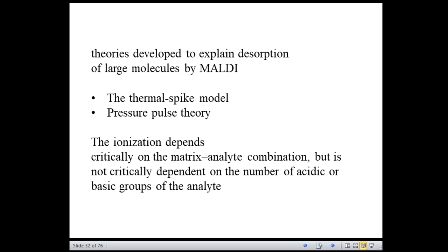And how does the desorption of large molecules by MALDI happen? Several theories have been developed to explain the process of desorption. Desorption is essentially the removal of the ions. We need to understand how desorption occurs.